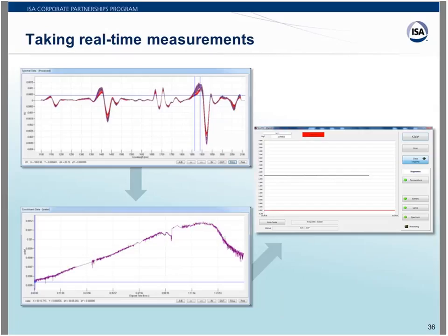The images in slide 36 are an example of detecting moisture content in a powdered chemical during a manufacturing process. The top image on the left-hand side is mathematically processed near-infrared spectra of the powdered chemical acquired at various time intervals during a production process. And the bottom image on the left-hand side shows the moisture content observed in the same powdered chemical during the real-time production process. As you can see in the bottom left figure, the amount of moisture keeps increasing until the time point of 1 hour and 20 minutes, which is not so clear, and starts to decrease beyond this time point.